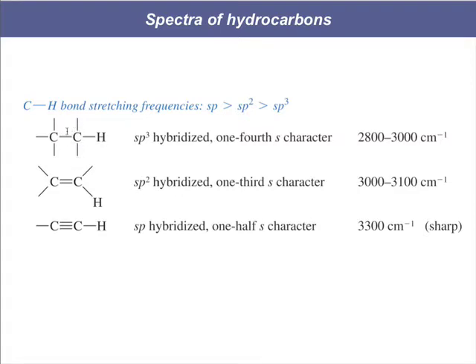So we can see the carbon-carbon single bond, or the carbon-carbon double bond, or the carbon-carbon triple bonds, again, 1200, 1650, 2200. We can also see the corresponding hydrogen bonds if they're there. If we have a terminal alkyne, we will see this sp hybridized carbon-hydrogen vibration. But if we have an internal alkyne, that hydrogen won't be there. That'll be a carbon instead, and we won't see that bond. So that can even help us determine whether a double bond or a triple bond are internal or terminal.